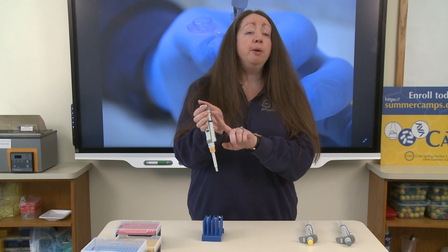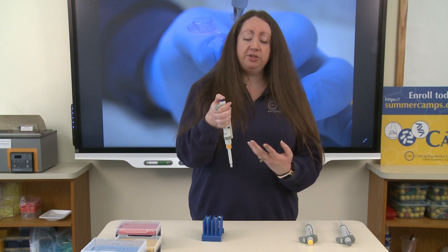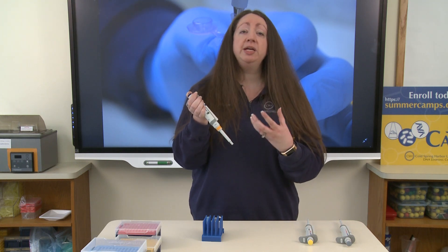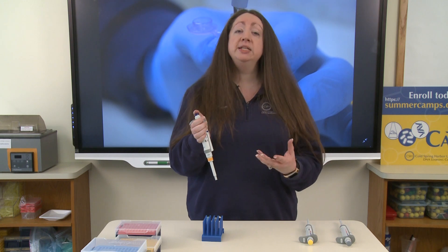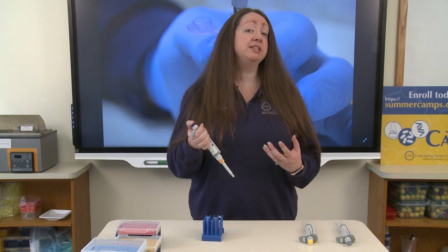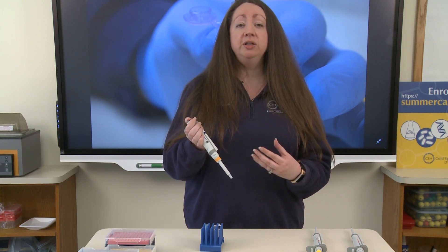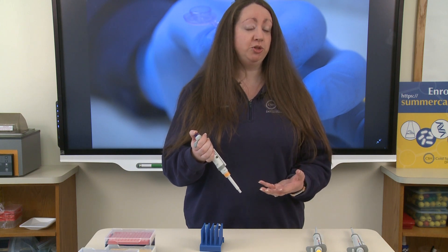That first stop is what we use to measure this particular volume of liquid. When you press down to that stop, you're expelling that volume of air from the bottom of your pipette. When you then place the pipette into a solution and slowly raise your thumb, you will draw up the correct volume of liquid. The second stop is for expelling the liquid — pressing all the way down to the second stop allows a second puff of air to ensure all of the liquid is removed into the tube you are transferring your solution into.